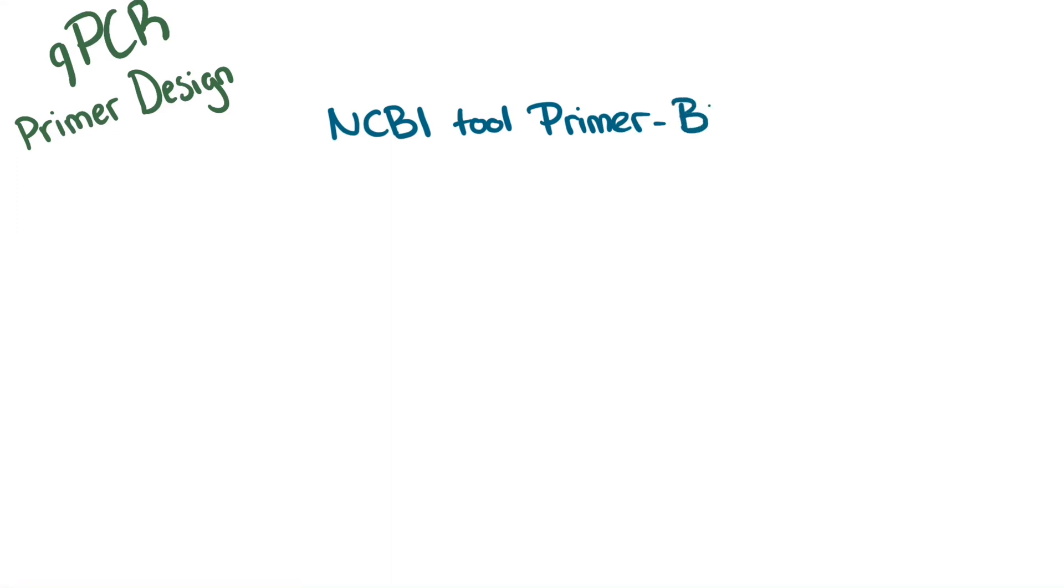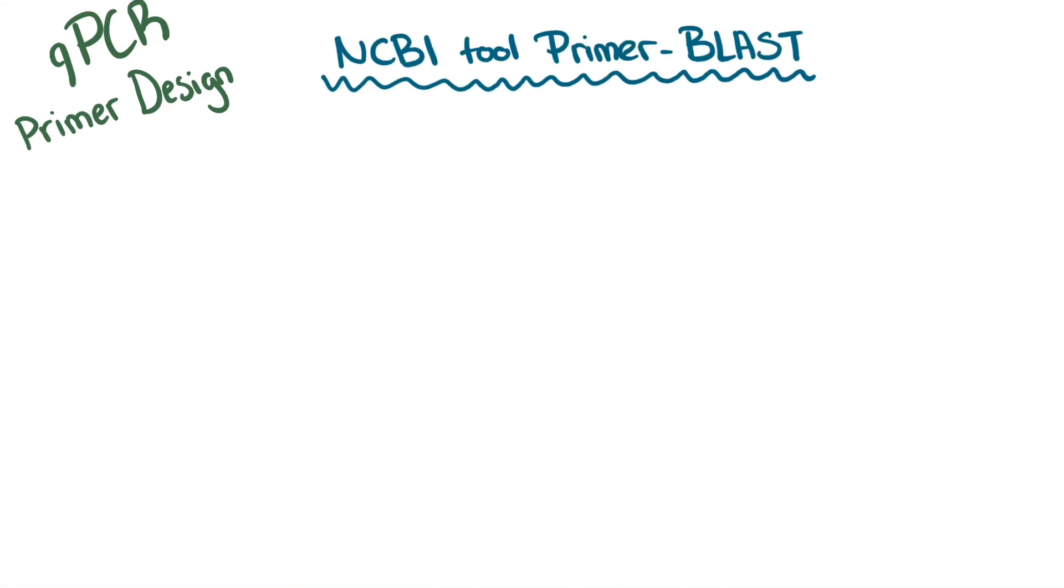NCBI tool Primer-BLAST is a great tool to use for primer design. Before jumping into an example, let's cover some important parameters.